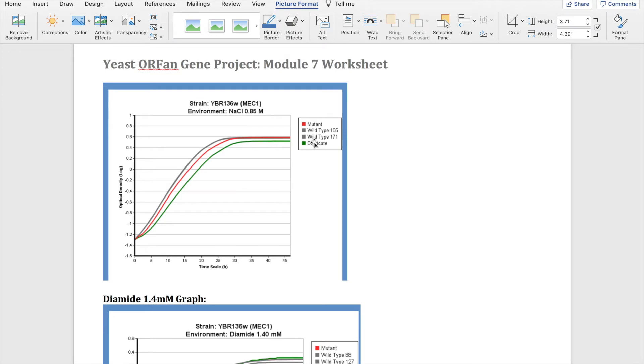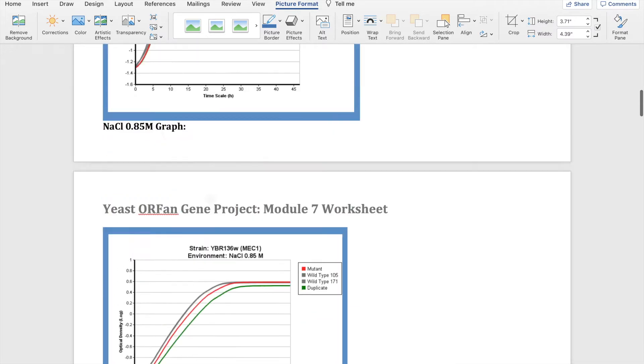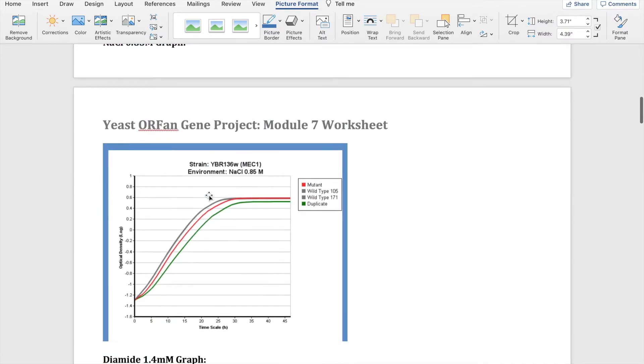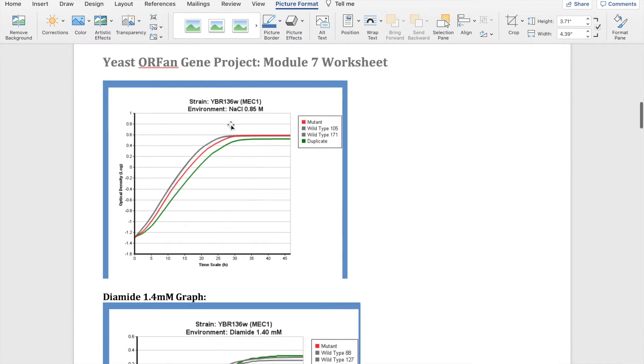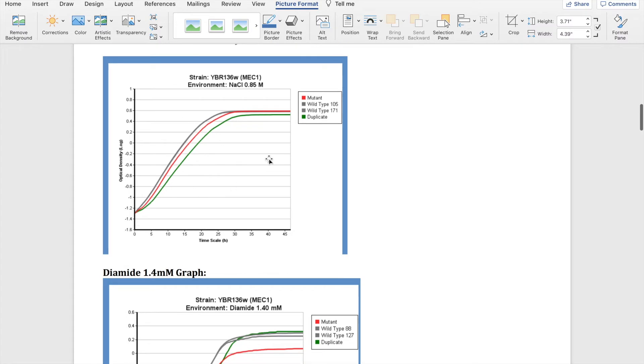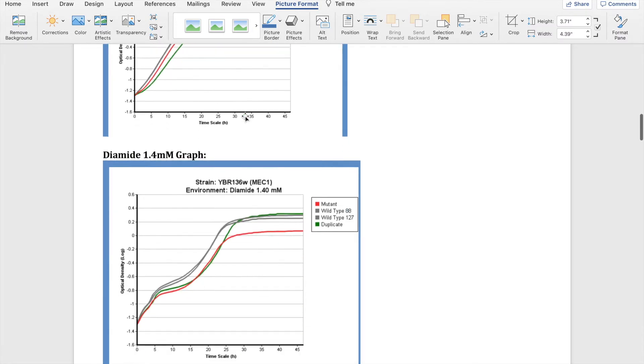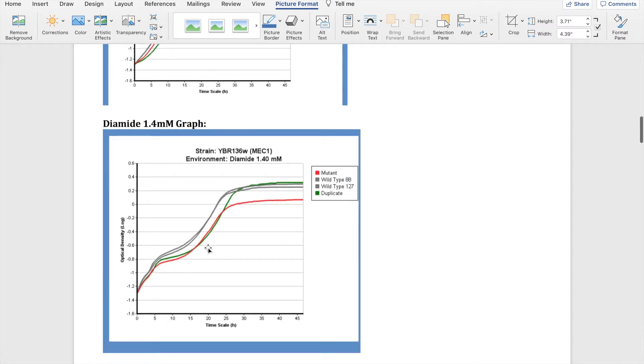Now we have the high salt environment and as you can see both the mutant and the duplicate show a little less density in terms of growth. The duplicate shows a little more in terms of not growing as densely, but they do seem to almost level off at the end of the time for the growing. But the duplicate doesn't quite get to that spot as well, so NaCl could inhibit its growth too.